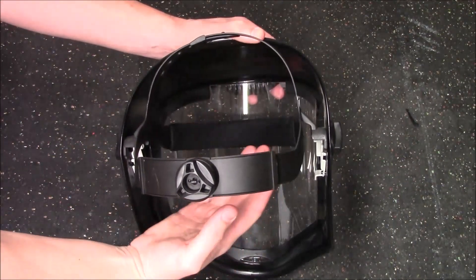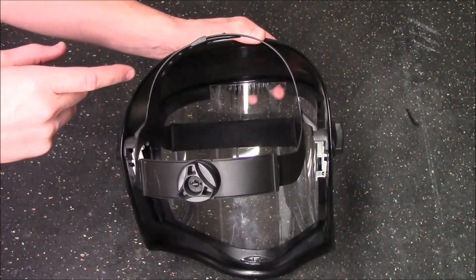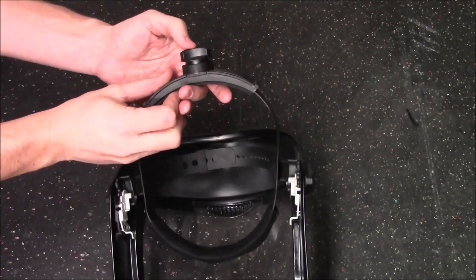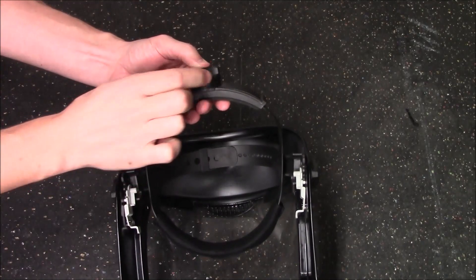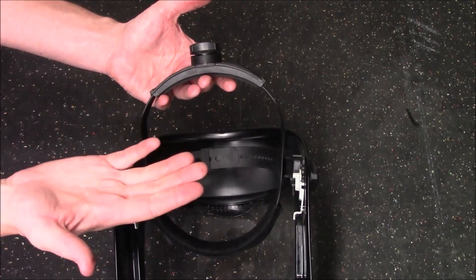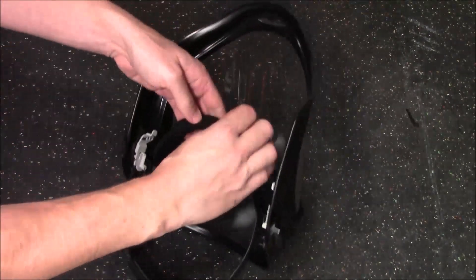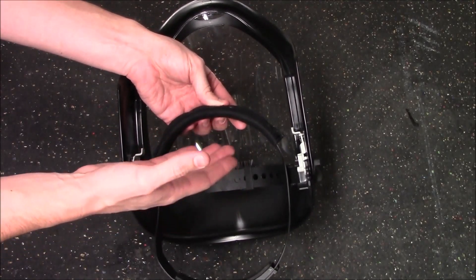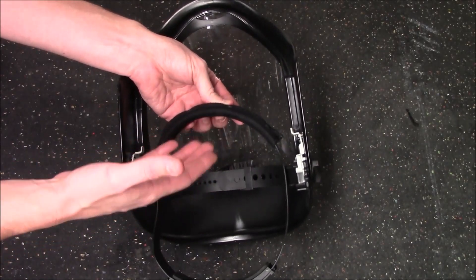The head portion is adjustable both in height and circumference. There's a small knob — press it in and turn it. One direction tightens it up, the other loosens it, and once you let go it locks everything in place. On the front there's a felt pad that sits against your forehead, so it's not solid plastic causing irritation. It's very soft, like the inside of a hat.